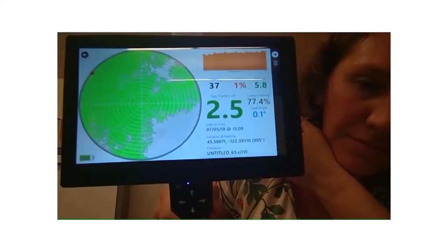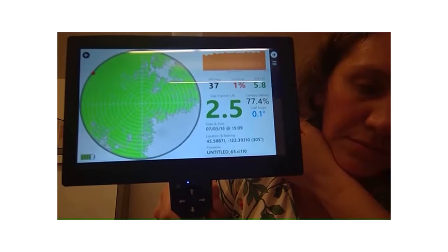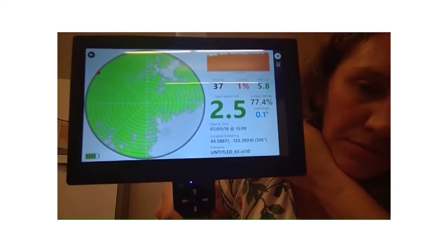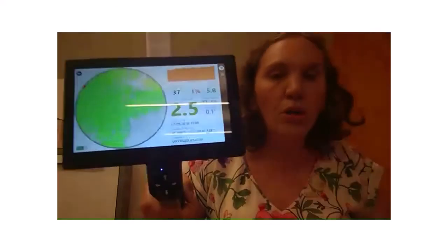And would a physical polarized filter help at all with sun flare and whatnot? We heard mention that in addition to the neutral density filters there was maybe a polarized one? No, okay, we didn't hear that. I was making that up. Perhaps that's something to investigate.